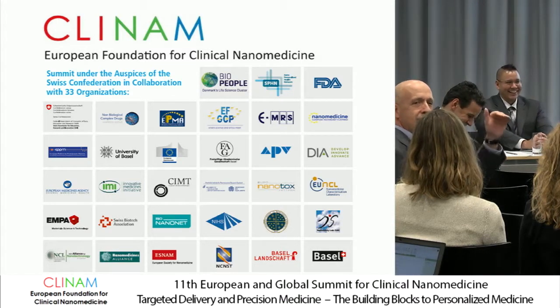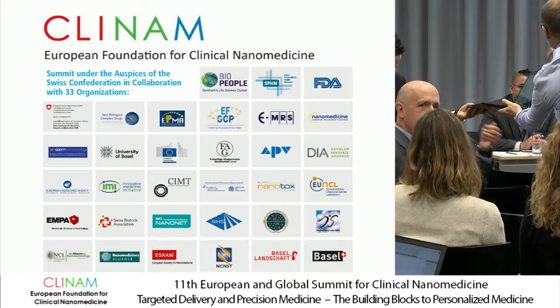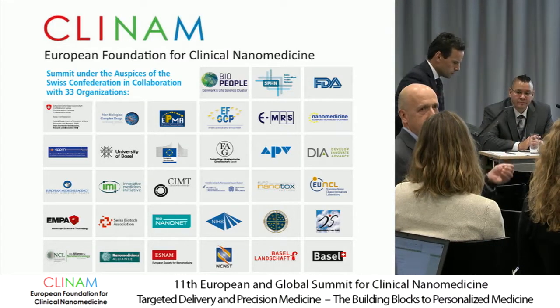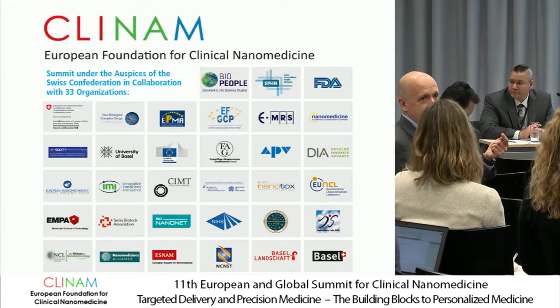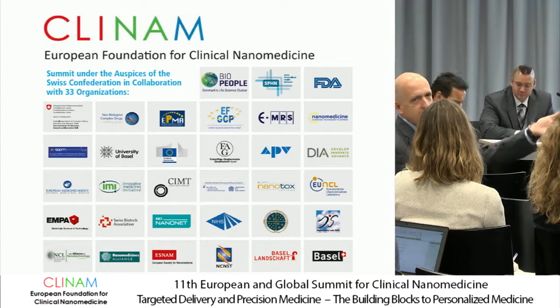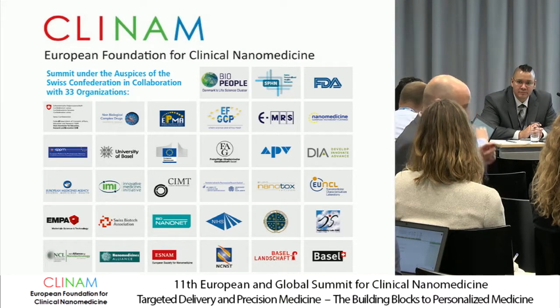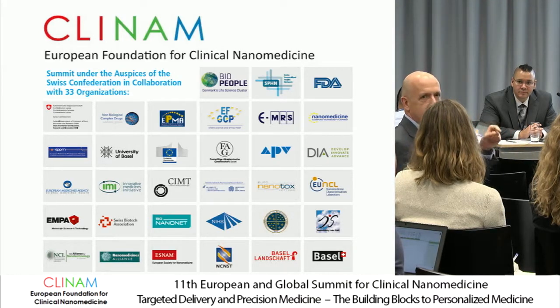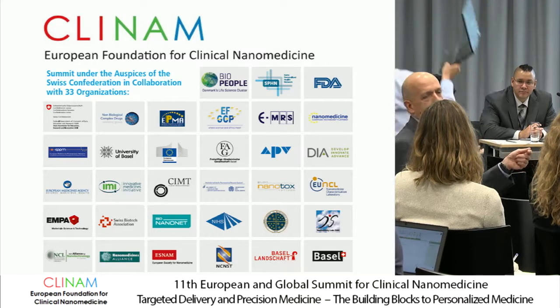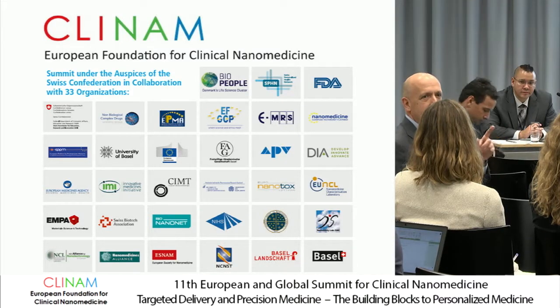And over there, you will see not just the SOP, that's obvious, but you will see we report all the critical parameters that are needed for the analysis of the data. So that's a very good starting point to see that if you have a different material, you need to input a different refractive index or absorbance coefficient. On what you said, I hope in the future EUNCL will provide training, especially if there is a request from the community. I never thought too much about that, but your point is really good.